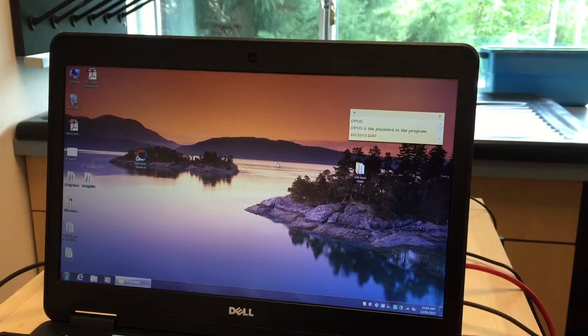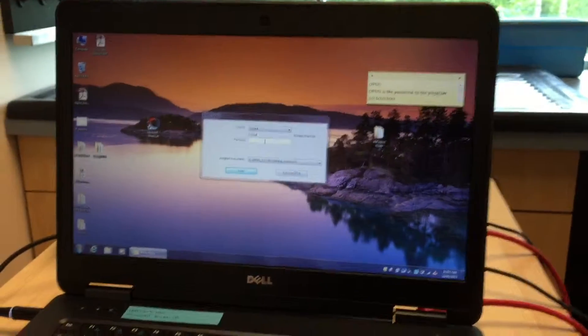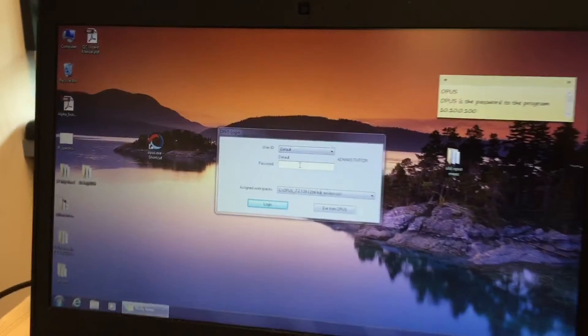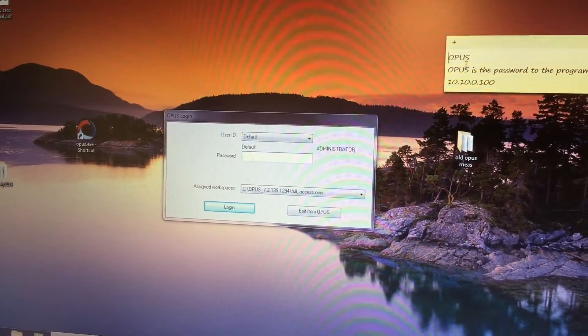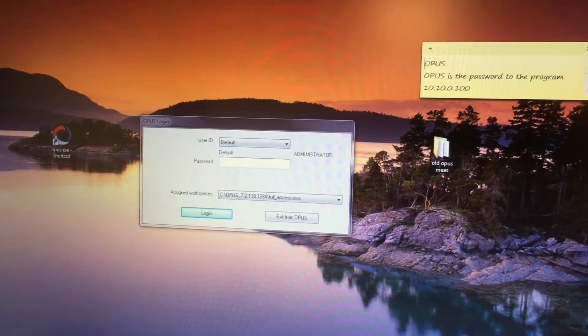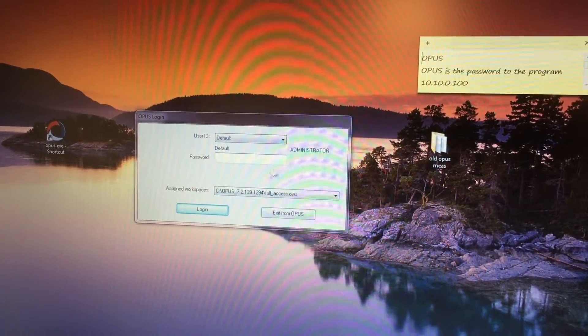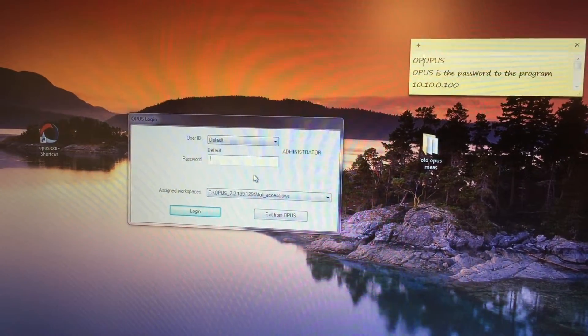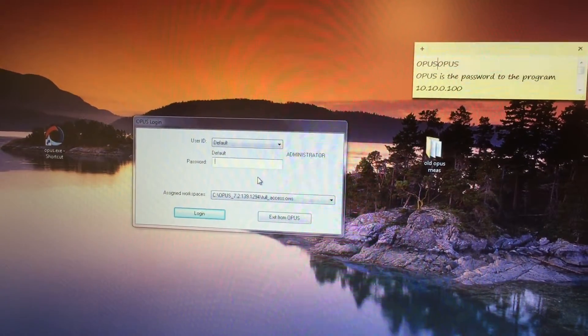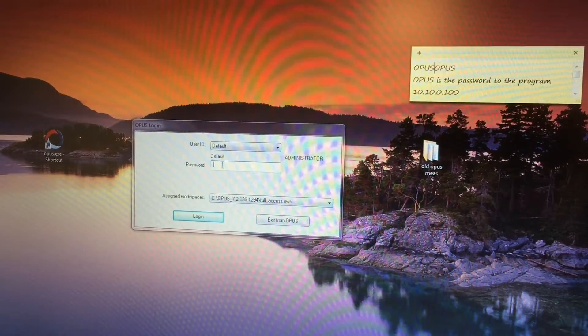Okay, now the password to get onto this is 'Opus'. We have a little sticky note here to remind you - all capital letters. Opus, that is the program name.